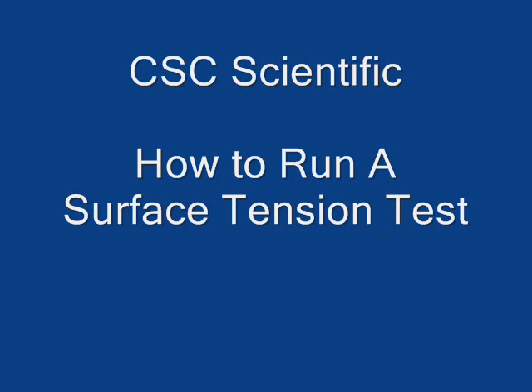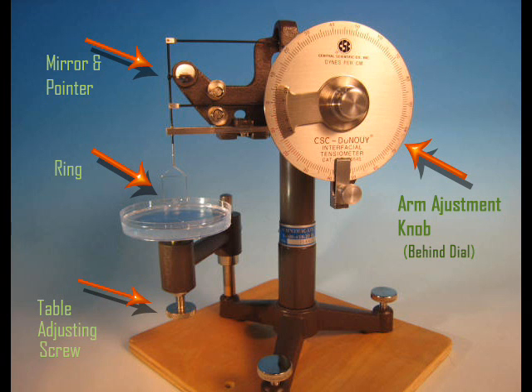This is a description of how to do a surface tension test using the CSC scientific tensiometer. The test results are read directly on the round dial on the front of the tensiometer.